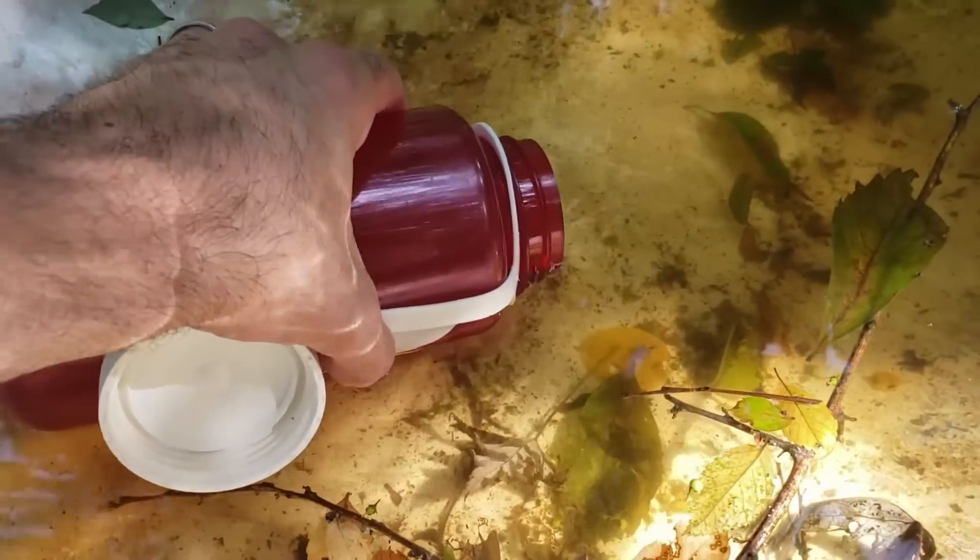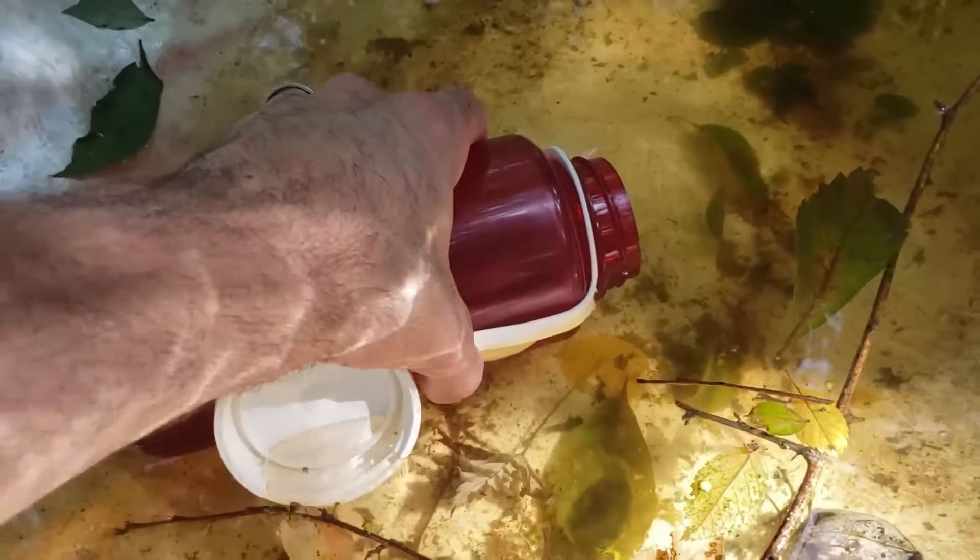This water has been sitting here for several days at least. You can see it's pretty nasty in here. So I'm sure we'll see a bunch of organisms in this water sample.